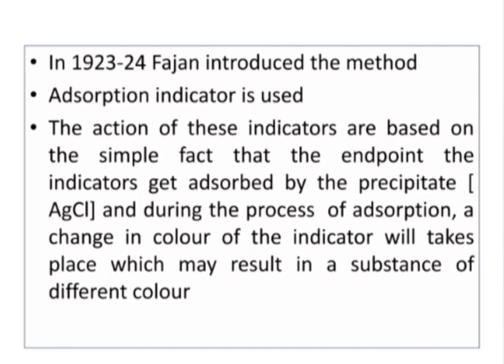Theory. Kasimir Fajans introduced the useful indicator for precipitation titration by studying the nature of adsorption. At the equivalence point, these indicators get adsorbed on the precipitate, resulting in a color change. These indicators are either basic dyes or acidic dyes. Acidic dyes, for example, fluorescein and eosin. This method uses the property of a colloidal precipitate to adsorb its own ions present in excess amount.